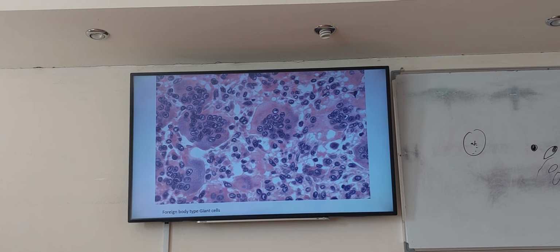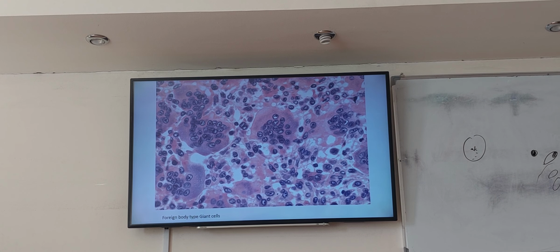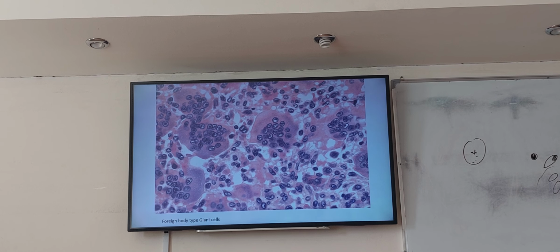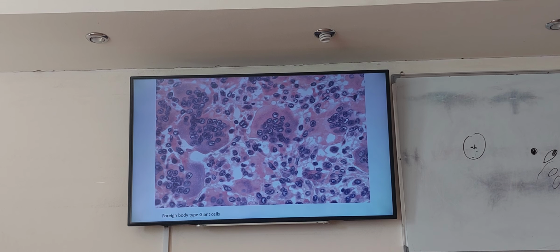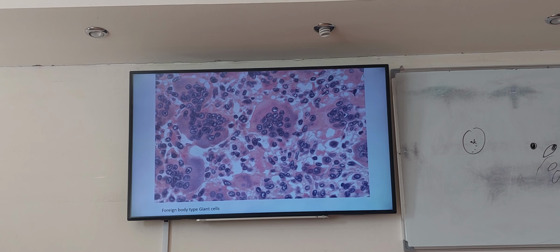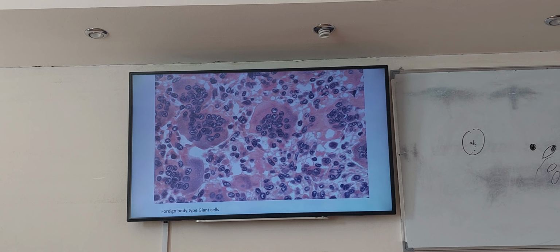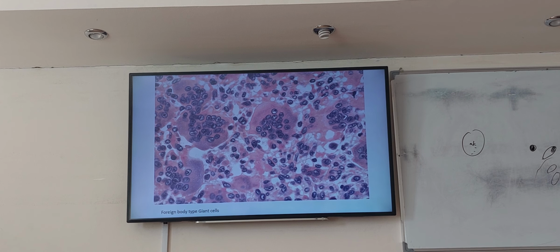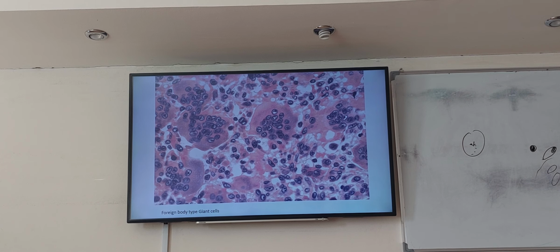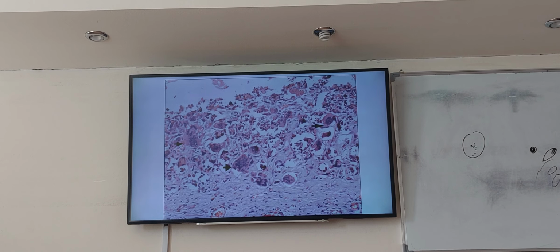You send us, as I said, keloids or scar tissues and hypertrophic scars, and you want to know what's happening, and I will say only multinucleated giant cells of foreign body type with sutures. So it's post-operative scar tissue that is hypertrophic. Okay? So it's important.